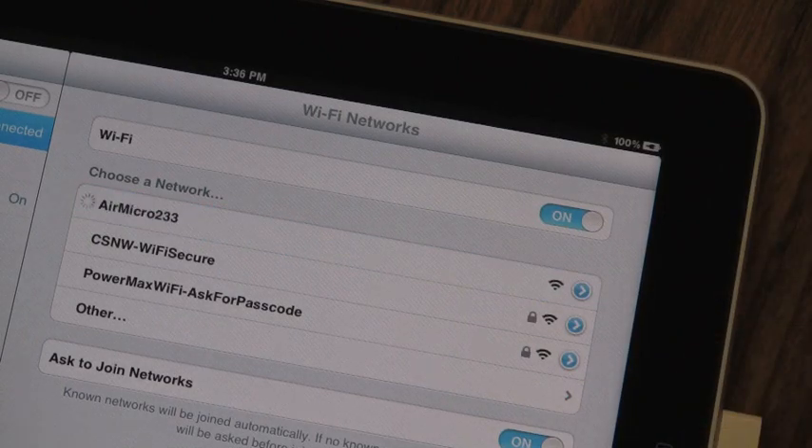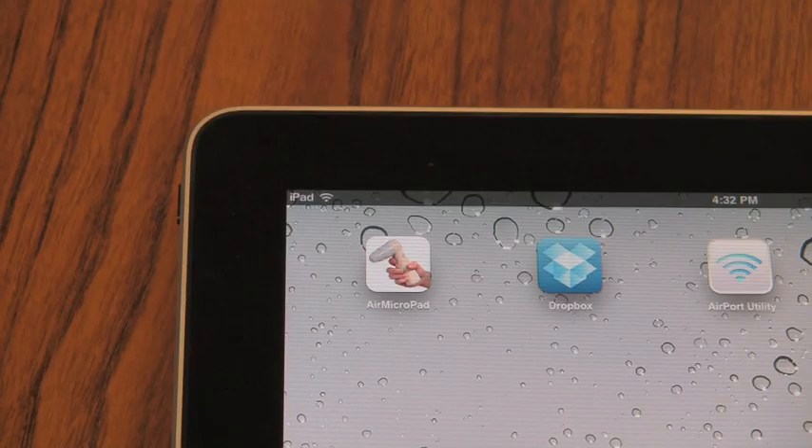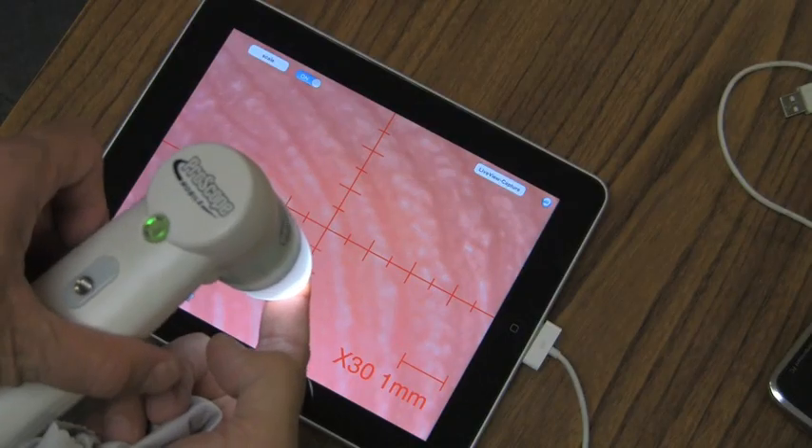So now that you have the network set up on your iPad, go back to the Wi-Fi and select the AirMicro network. Go to your AirMicroPad app, and you're live.